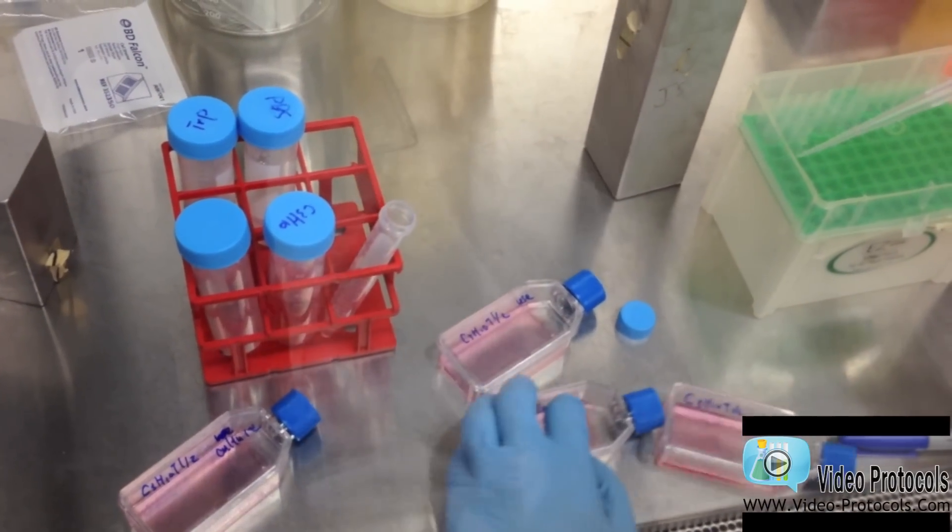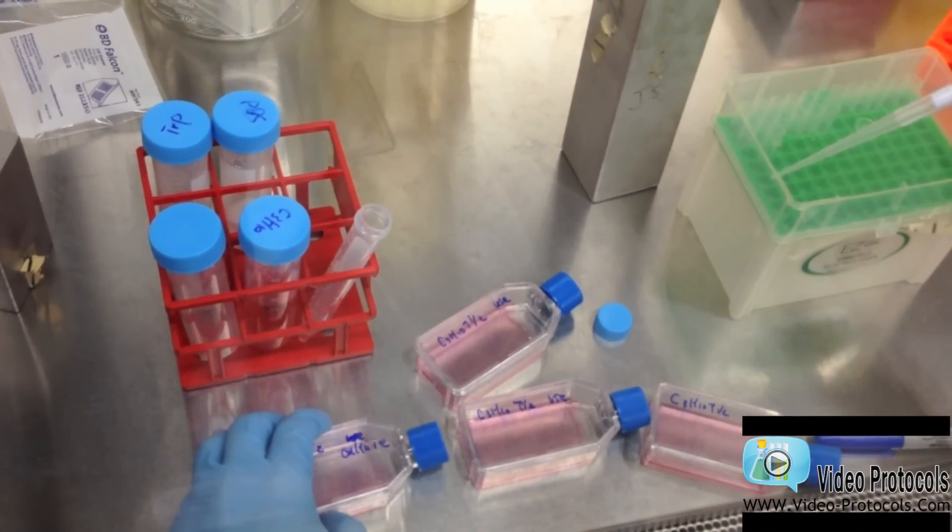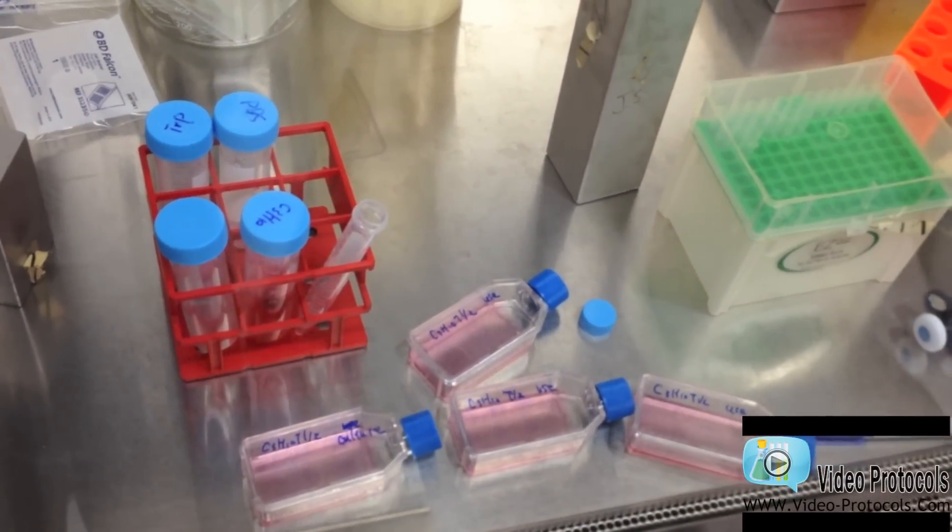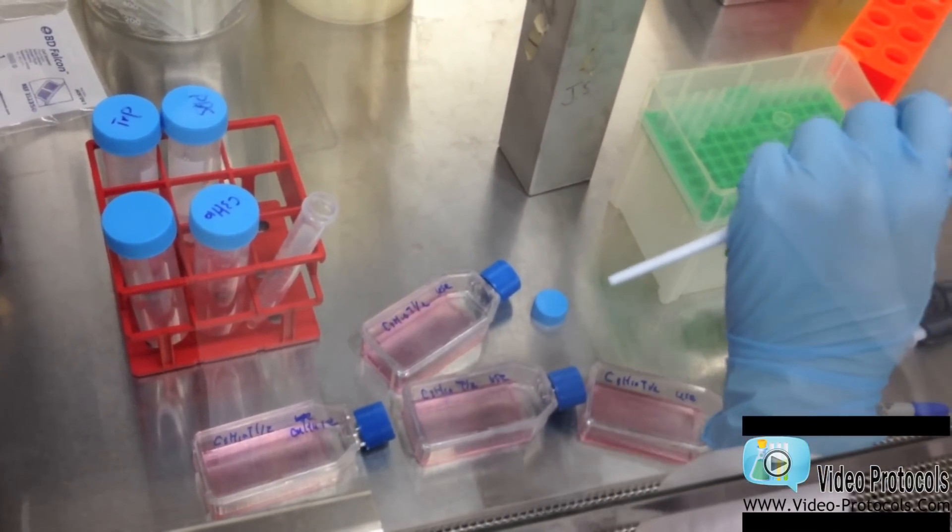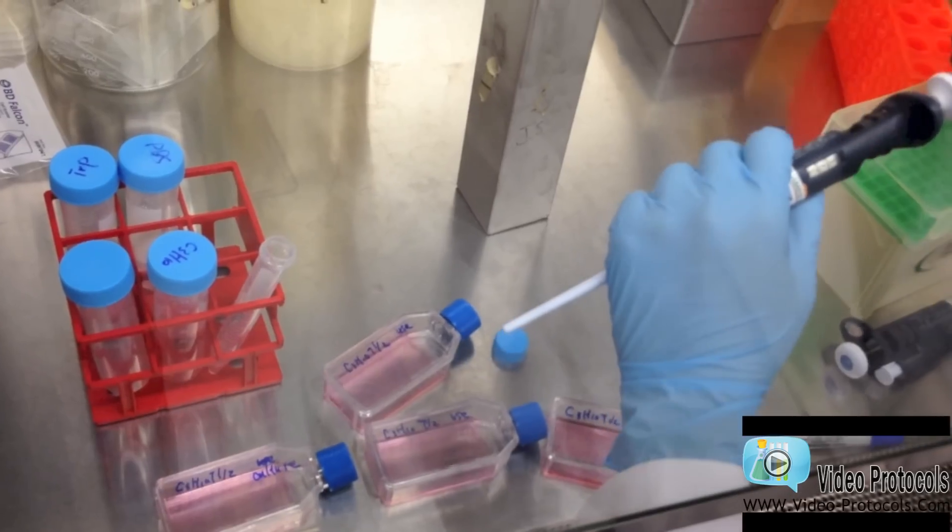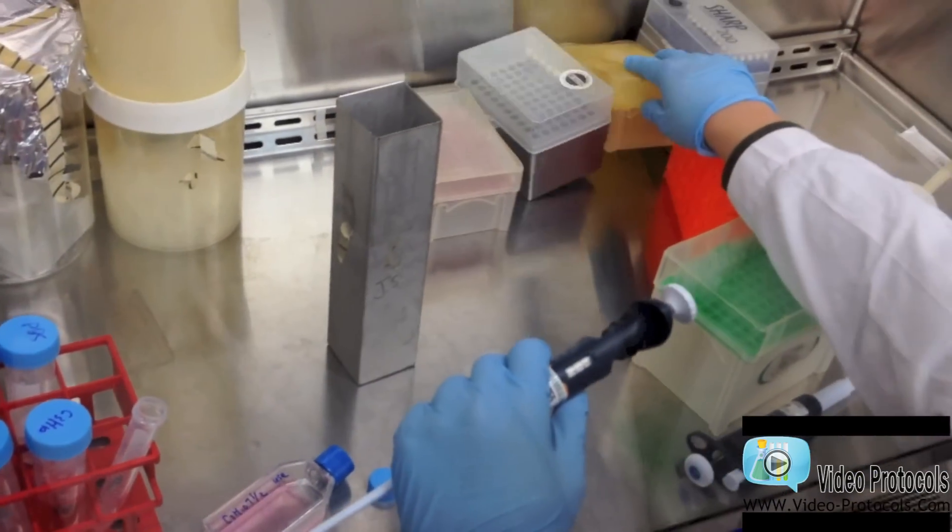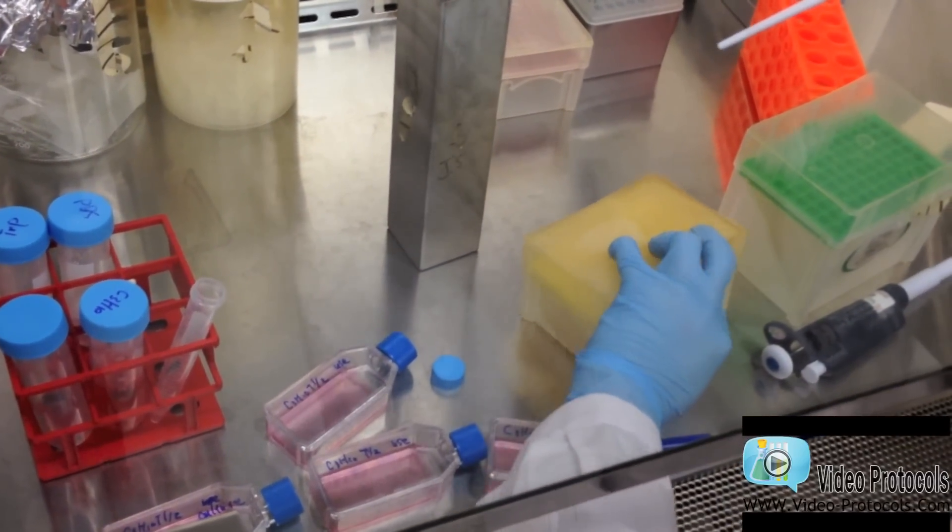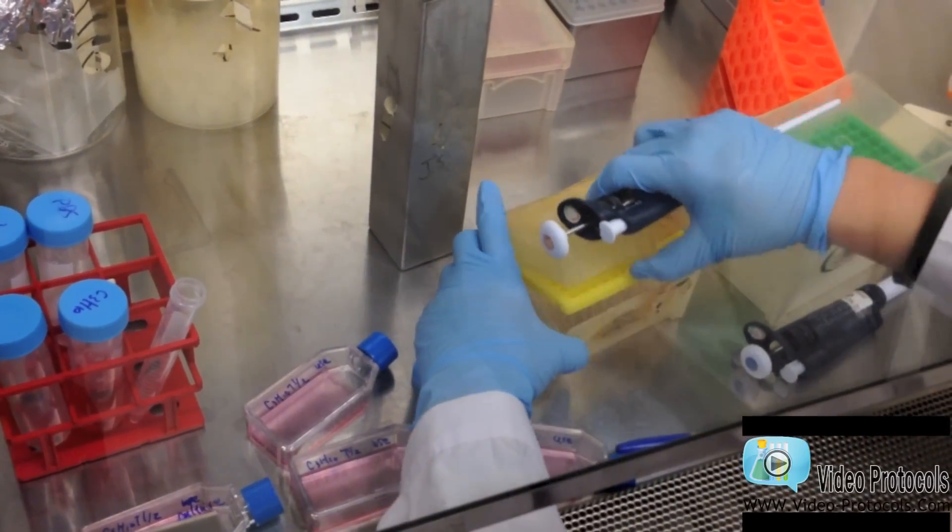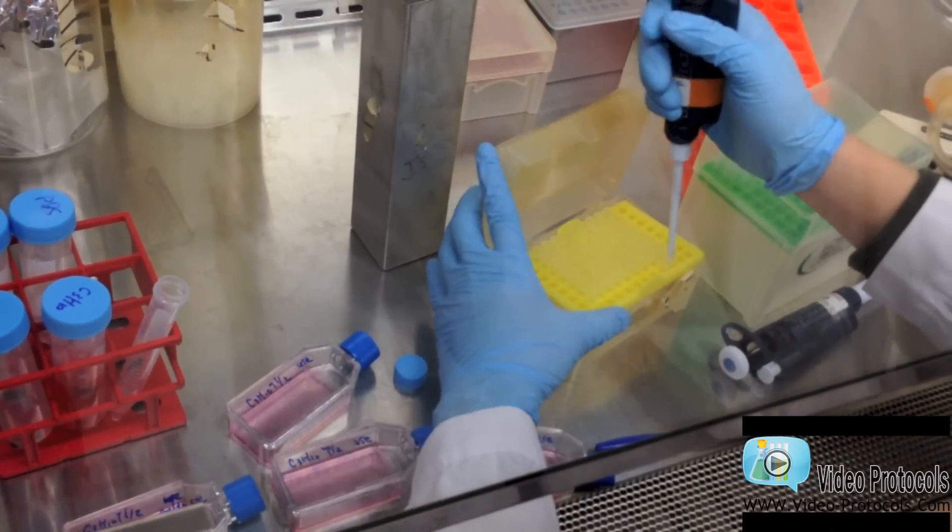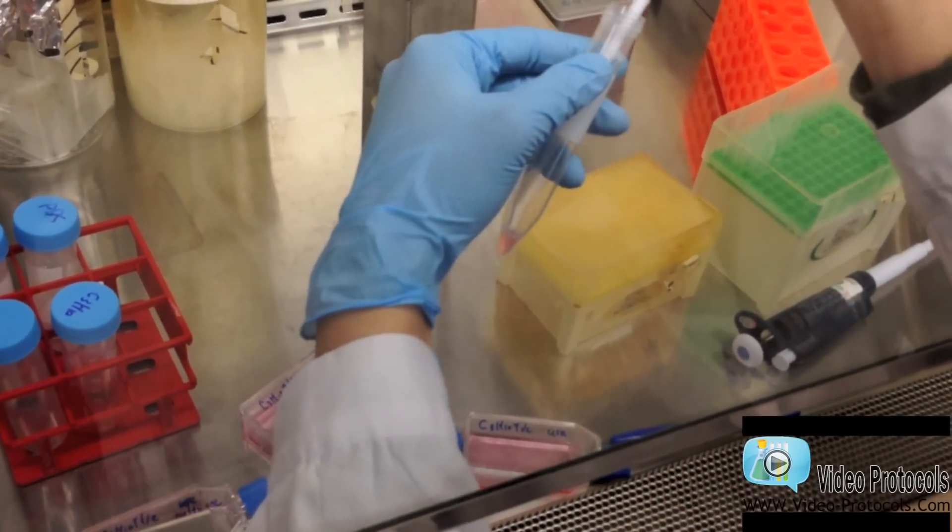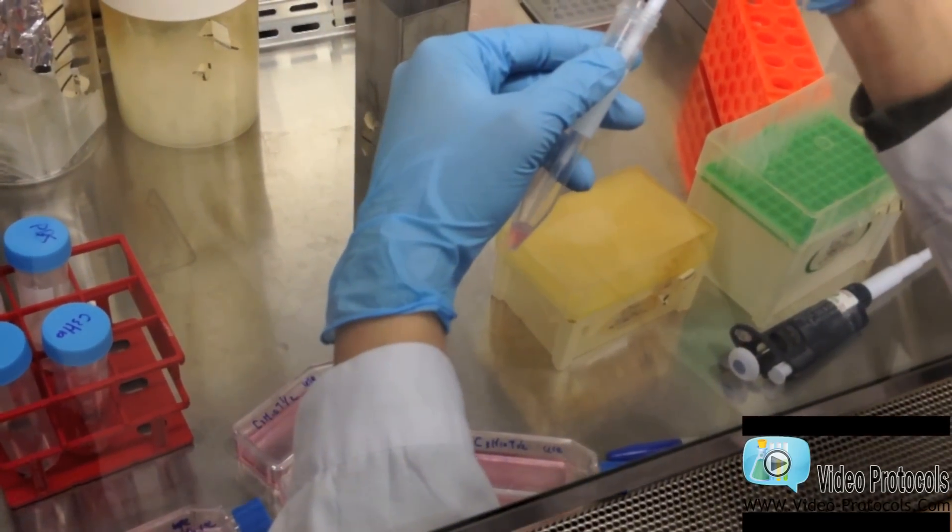And for this flask, I would like to use a more diluted cell density. So I can simply just add less volume.